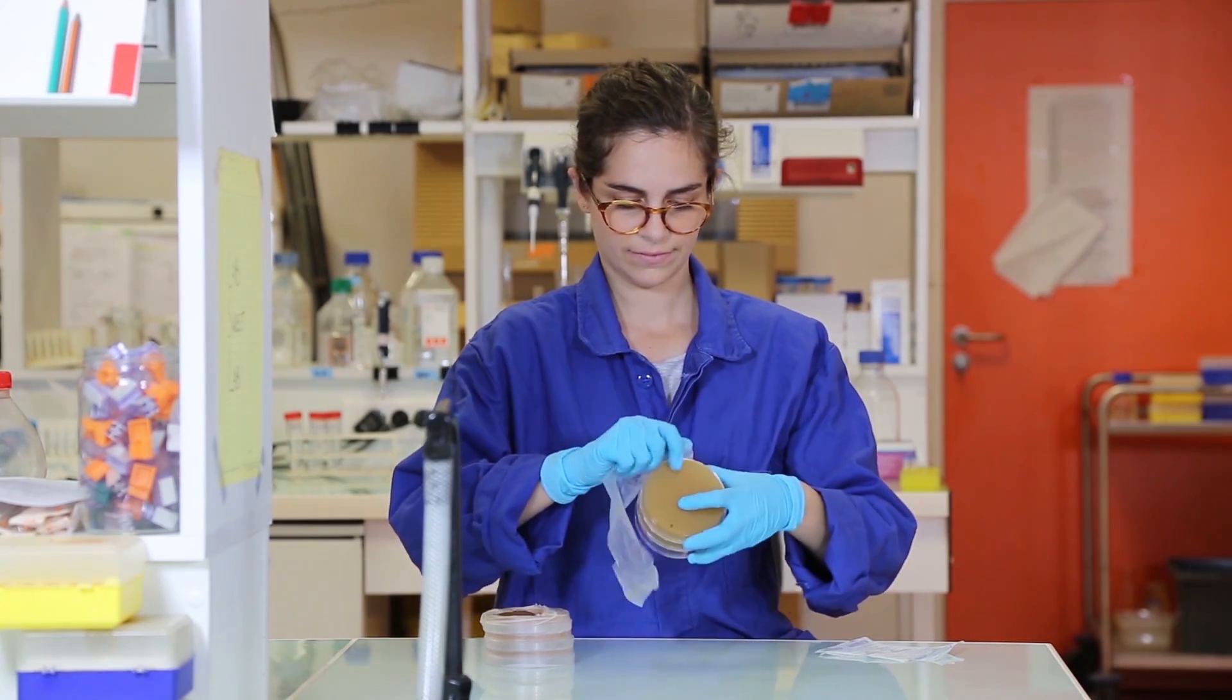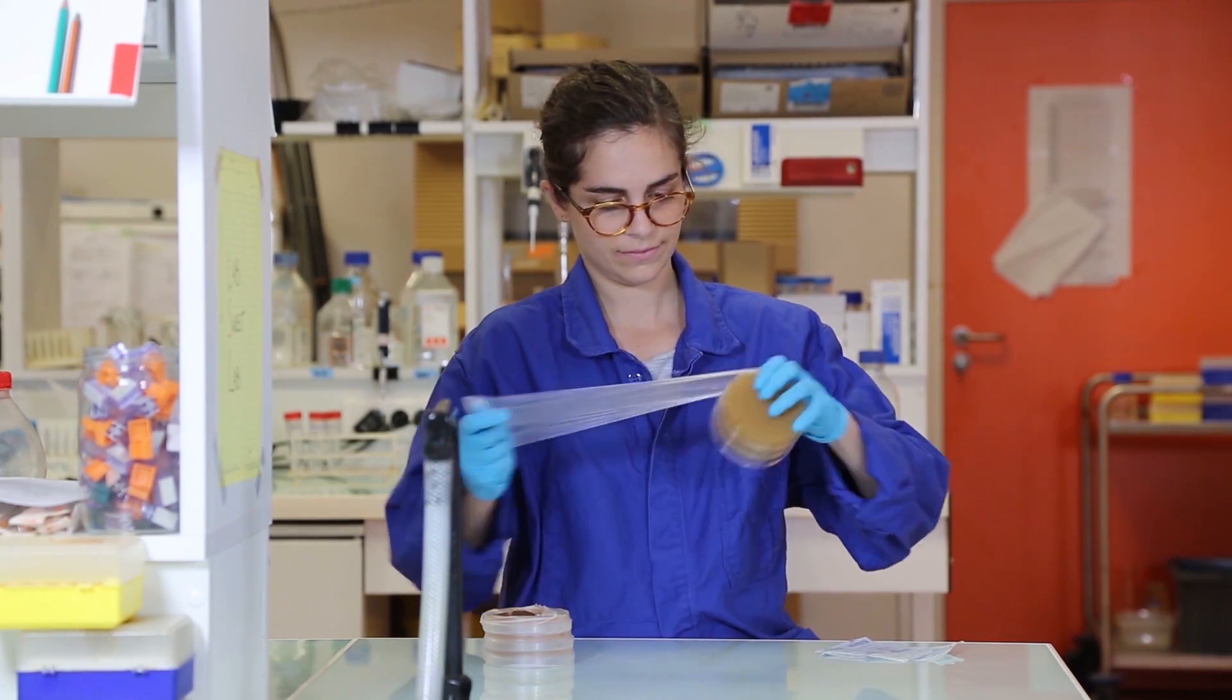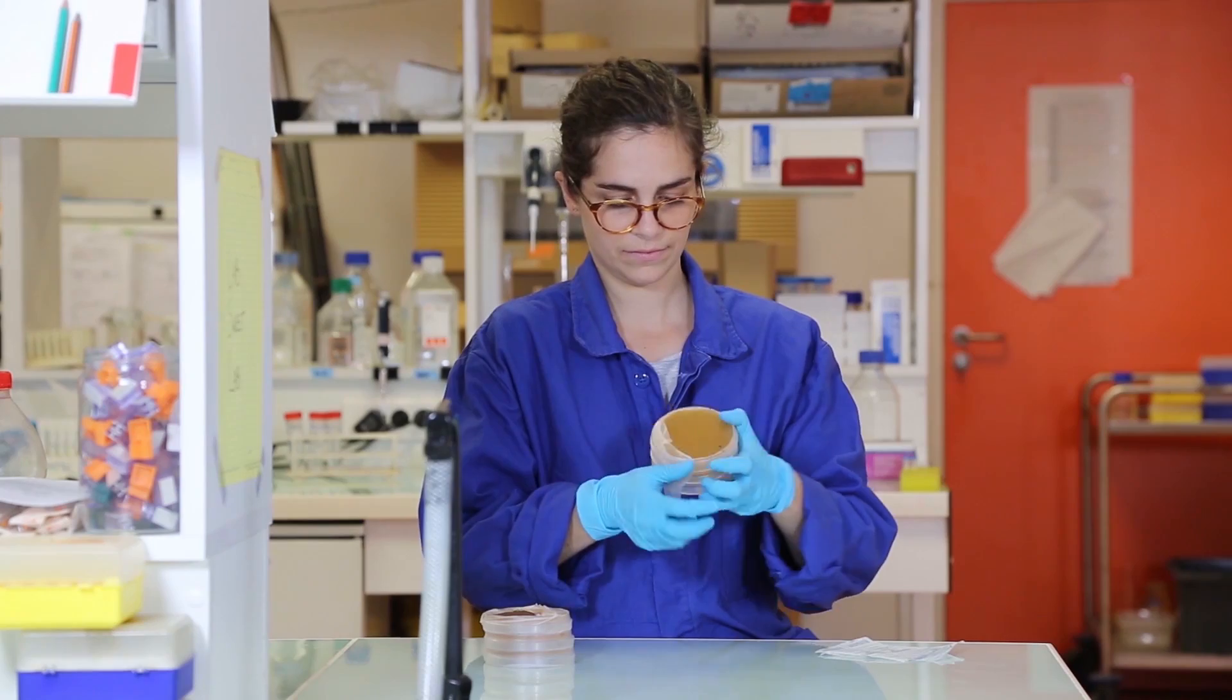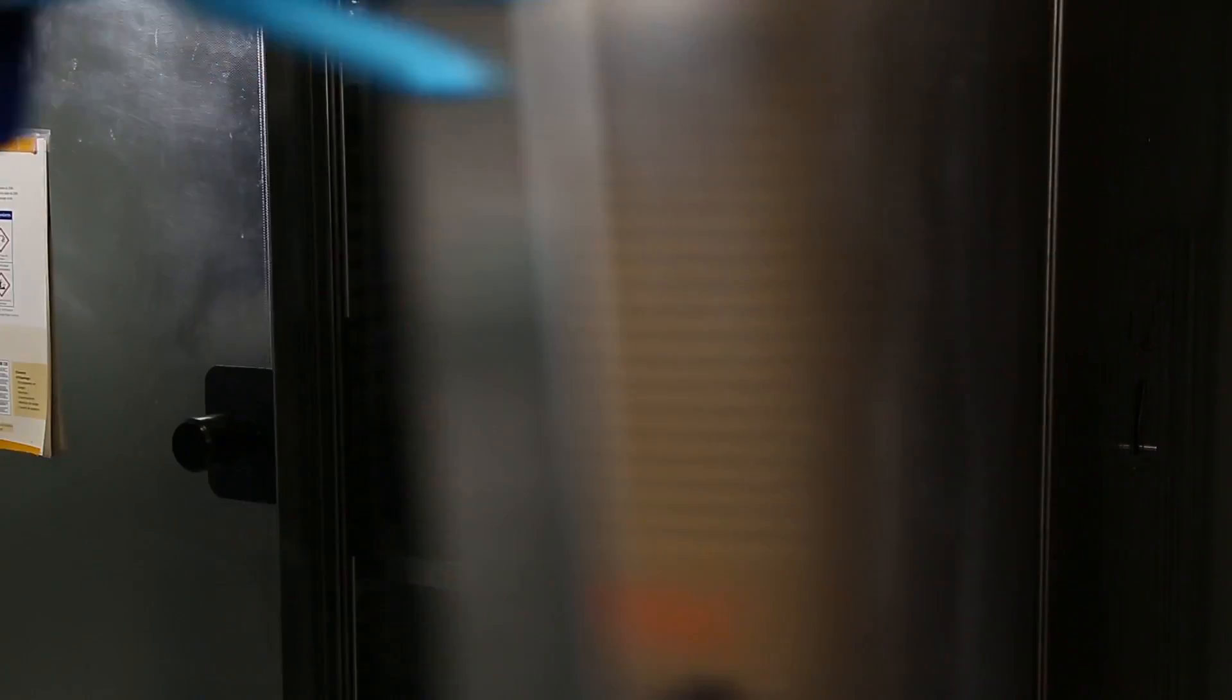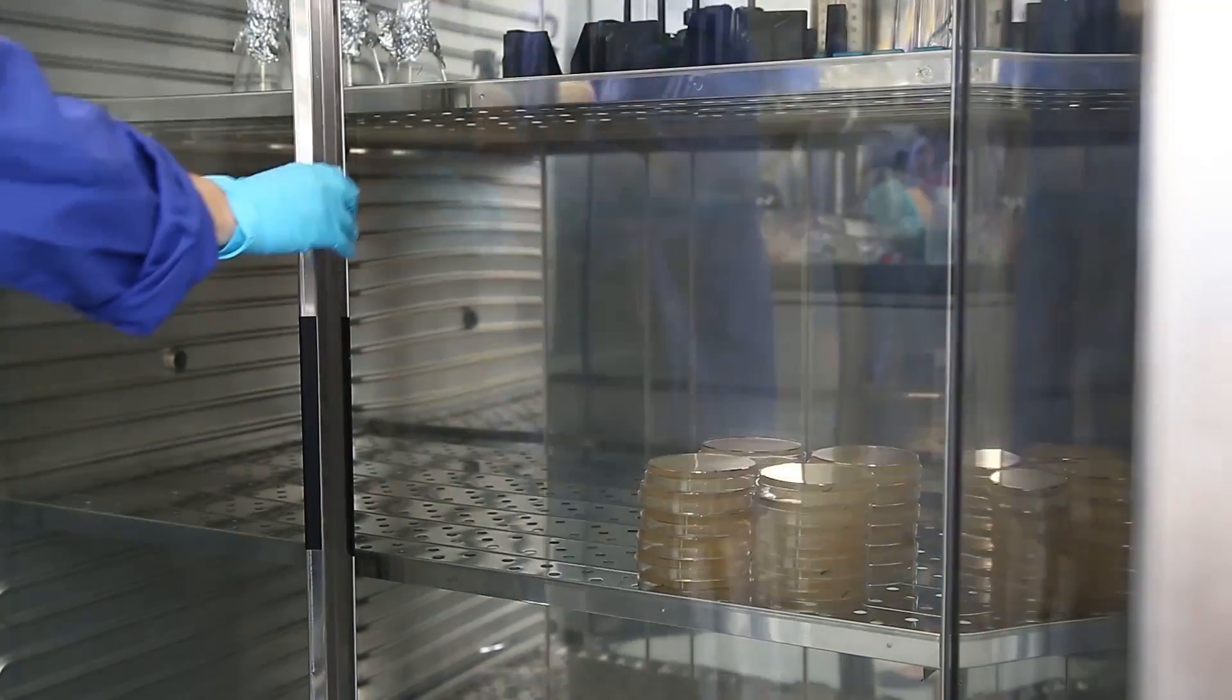If we count 50 cells on the 100,000-fold dilution plate, then we estimate that we have 500 times 10 to the 5th, or 5 times 10 to the 7th, about 50 million cells per gram.